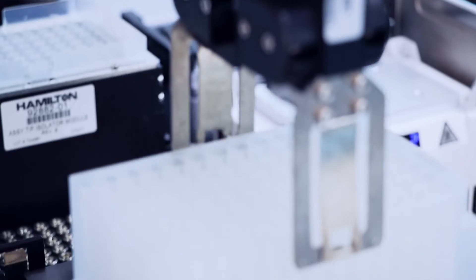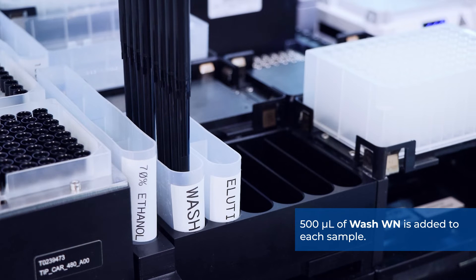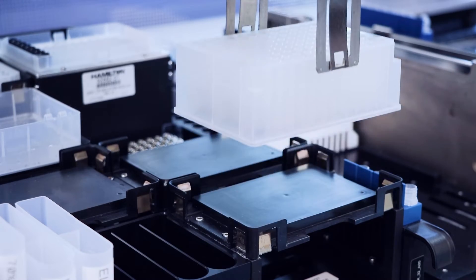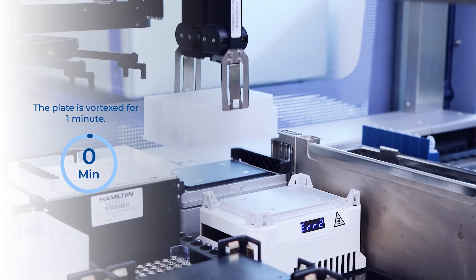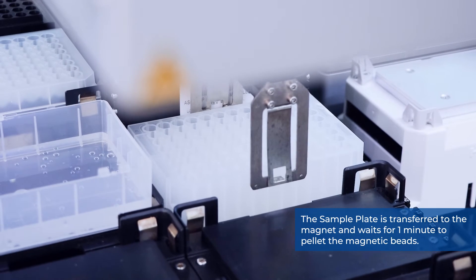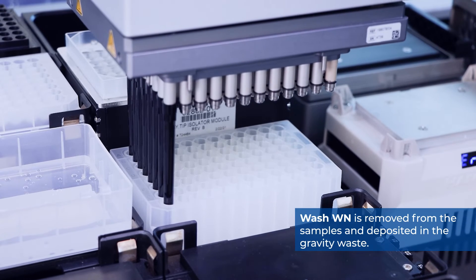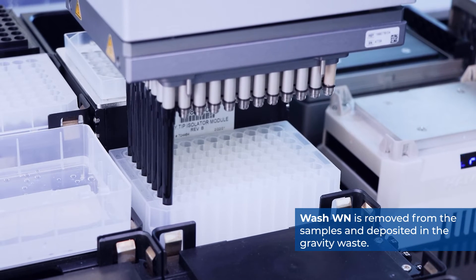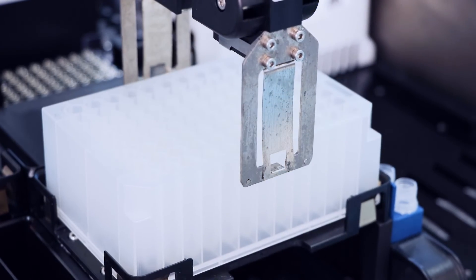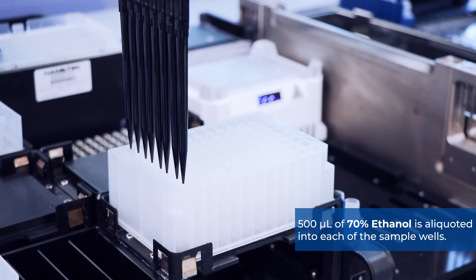The sample plate is transferred back to the starting position, and 500 microliters of wash WN is added to each sample. The sample plate is transferred to the shaker and vortexed for one minute, then transferred to the magnet for one minute to pellet the magnetic beads. Wash WN is removed and deposited into the gravity waste. The sample plate is returned to the starting position, and 500 microliters of 70% ethanol is aliquoted into each sample well.